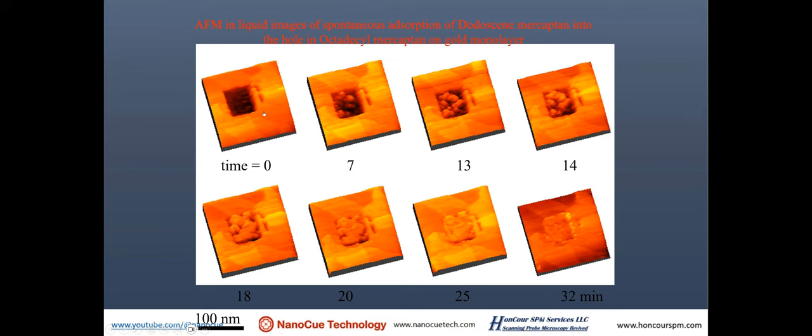When you use AFM contact mode, you have one very interesting benefit: when you're imaging something in contact mode, you have direct control of the force. Increase the set point, you increase the force. Decrease the set point, it decreases the force. You decrease the set point until the moment the tip and the sample separate, that's the moment you reach zero force. So you can control the force much more accurately and directly.